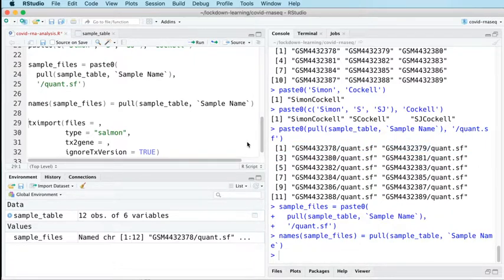But it is possible to give those numbers names, to give each of the elements of your vector a name. And that's what we're doing on this line here: we're setting names for each of the elements of our vector, so that they're not just referred to by a number, but they can also be referred to by their name. I'll show you what that looks like.